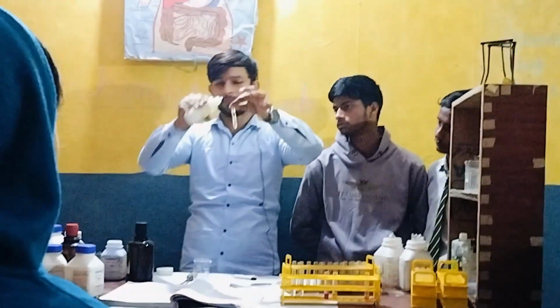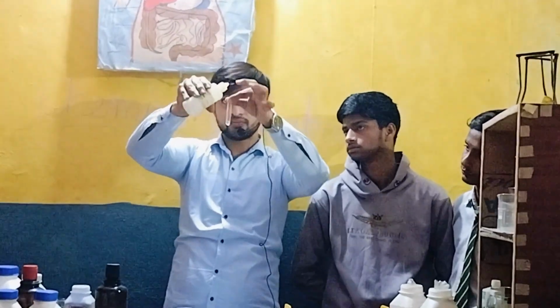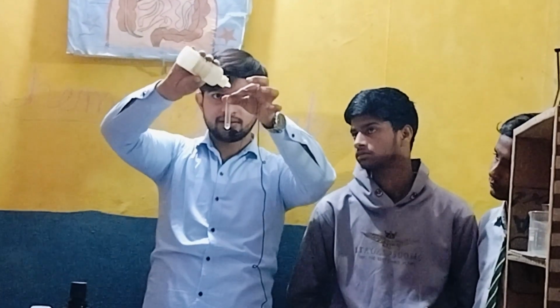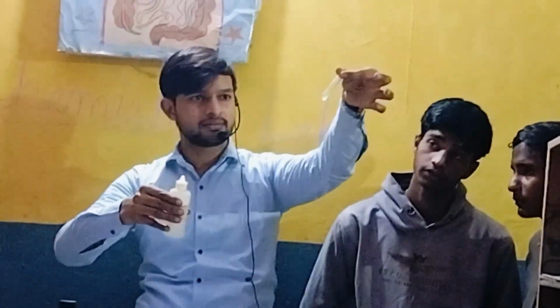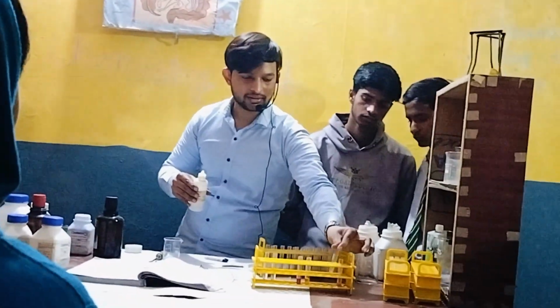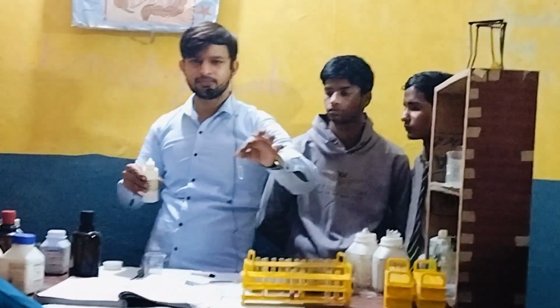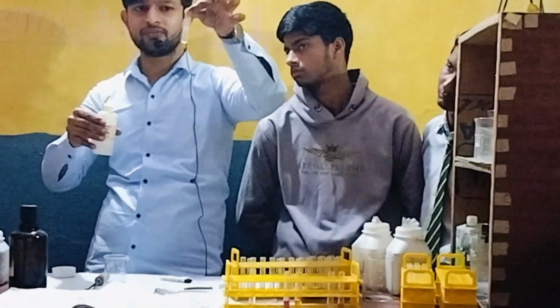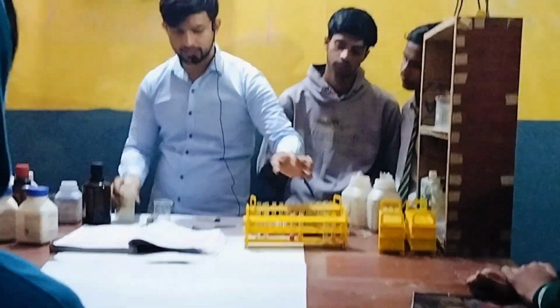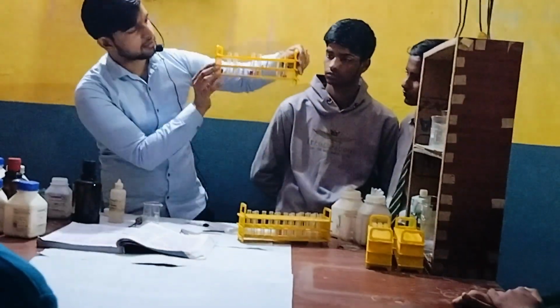Nothing will happen. You can see. See the color of this phenolphthalein. See everyone. White color. Nothing happens. Okay. Colorless. With water, the same thing happens. See. Nothing will happen with water also. Okay. So you can see the color of the test tube.